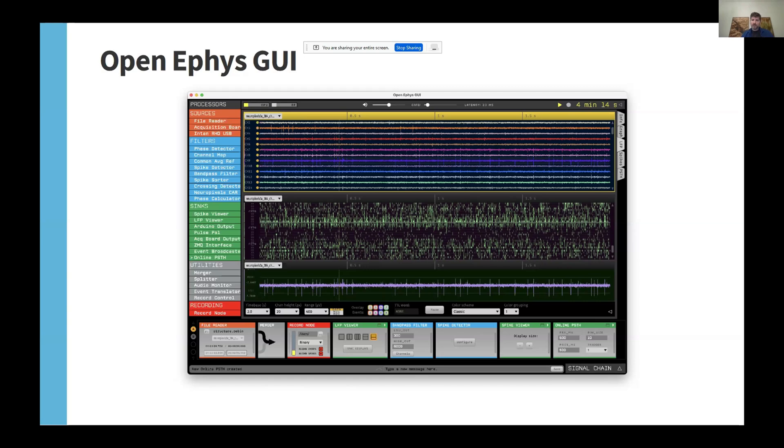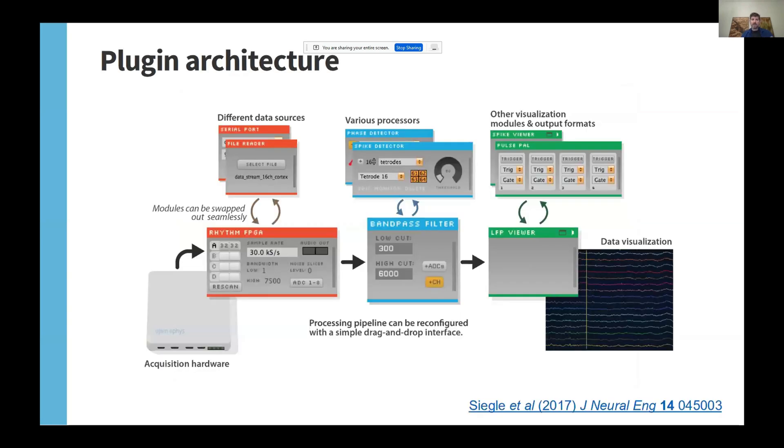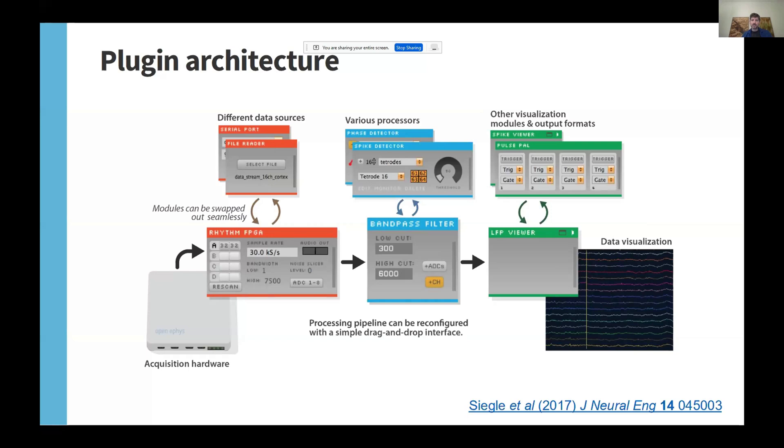The distinguishing feature of OpenEFIS GUI relative to other software in this domain is its plugin architecture. This means that all of the data is handled by plugins that are compiled separately from the main application. This makes it easy to customize your processing pipeline for different experiments or use the same signal chain with a variety of different data sources. Plugins can easily be added and removed via the GUI's built-in plugin installer.